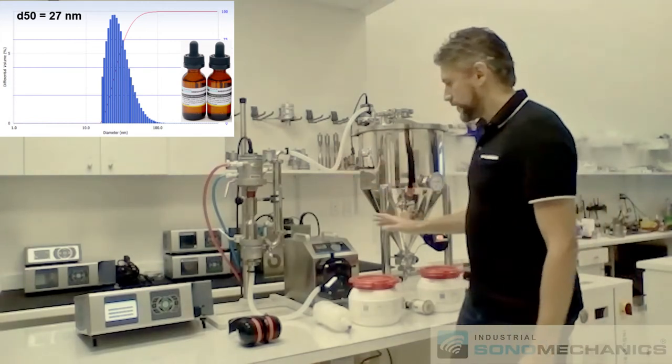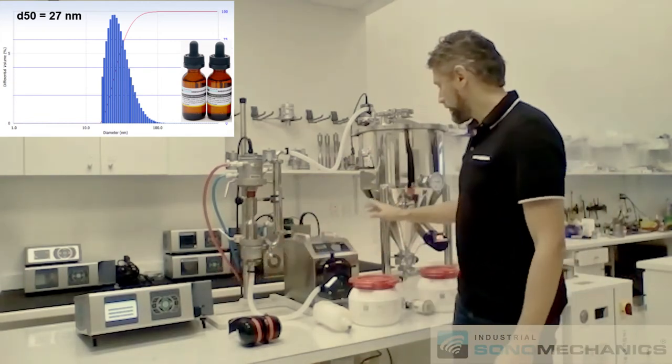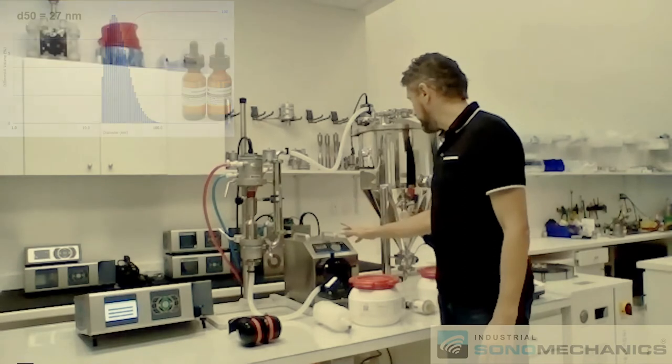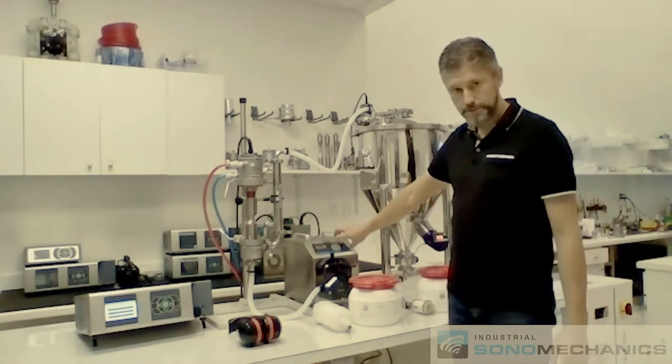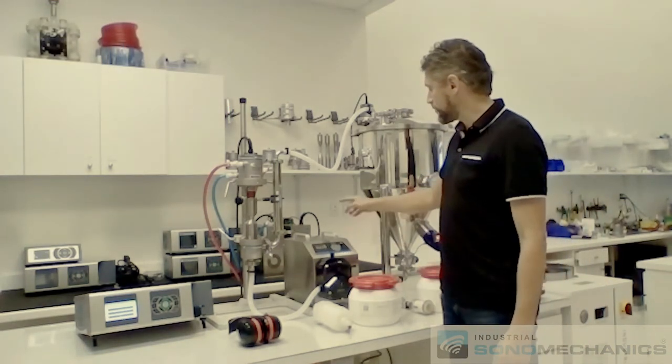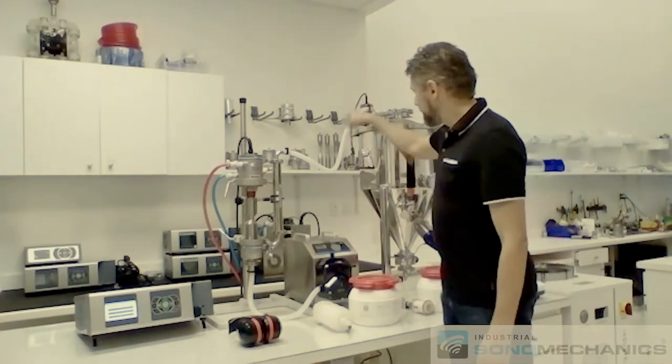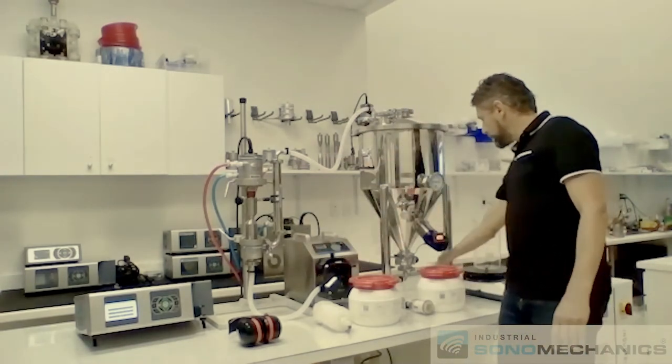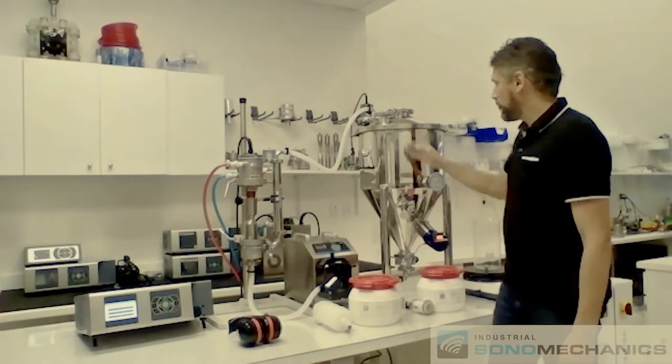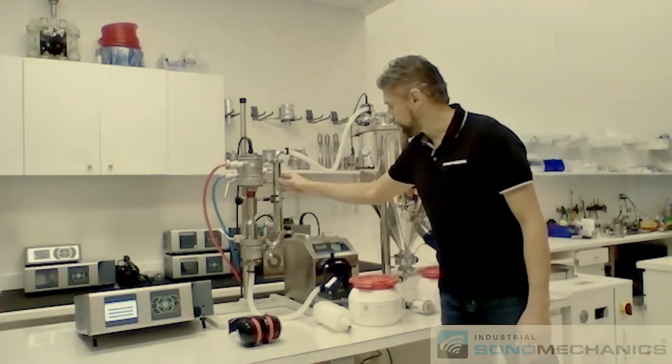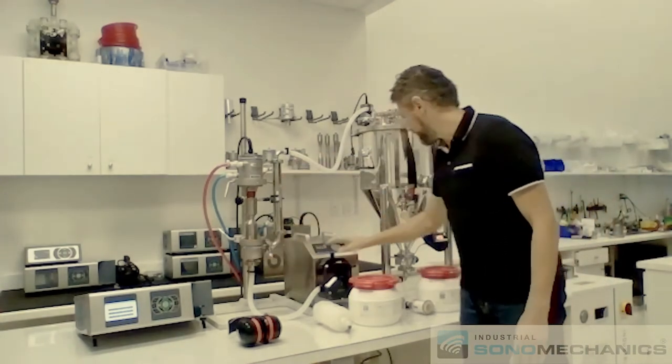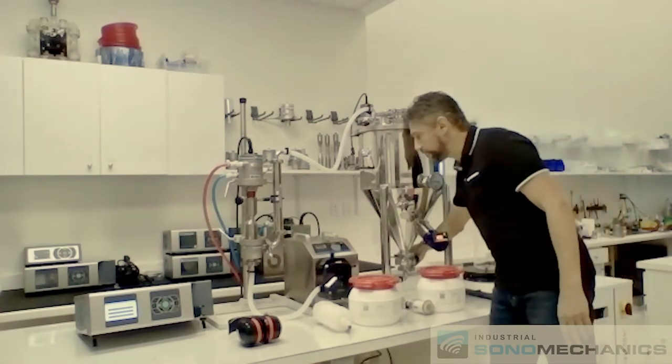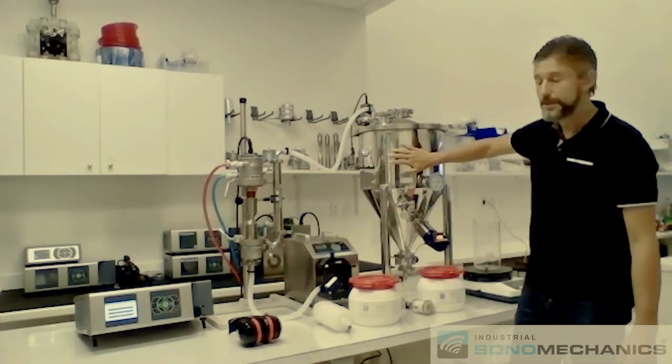Once the process is done, you stop the ultrasound, you stop the pump, reverse the flow direction of the pump, start it up again, that will collect all the liquid back into the tank. Once all the lines and the heat exchanger and reactor chamber everything's purged, you can close this valve and now you have all of your nanoemulsion here.